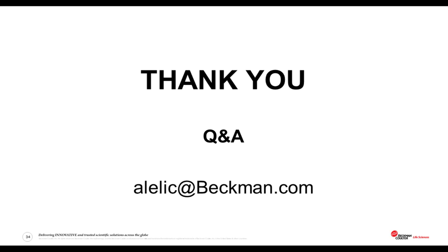Thank you for that. And which software would you advise for complex data analysis? Well, that's a really good question, but it depends on what you're trying to assess. The great thing about all of these algorithms is you can layer them. For example, most individuals who are doing complex data analysis are going to start with viSNE, and then they usually layer FlowSOM onto it.